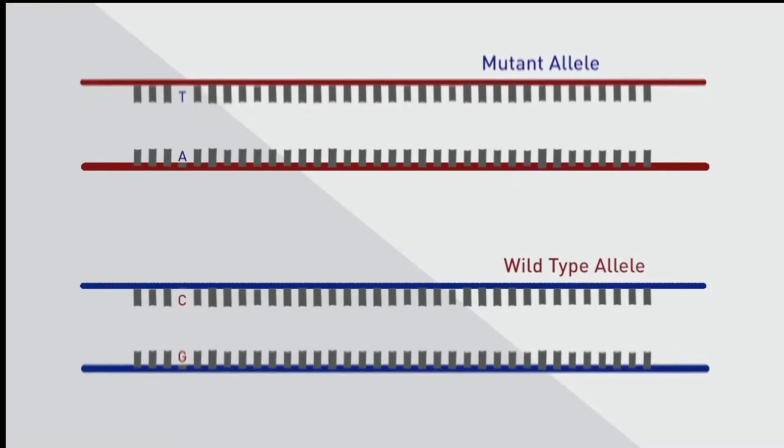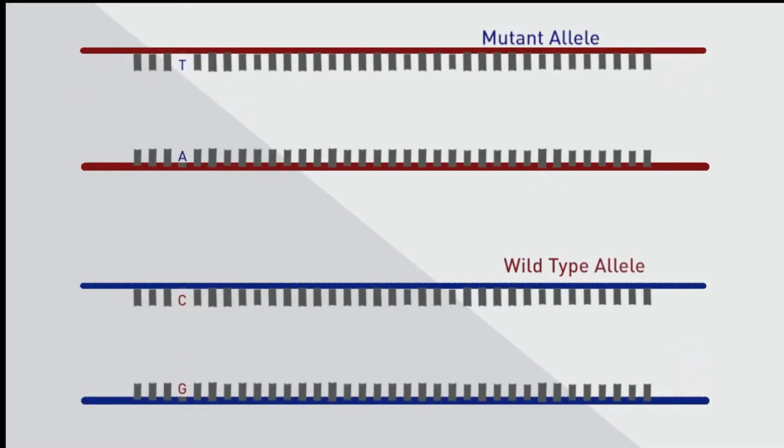A mutant allele assay based on qPCR technology contains 4 components. The allele-specific or AS primer is designed to be specific for a mutant allele in a target gene. A locus-specific primer is designed to be specific to the target gene. This will bind to mutant and wild-type allele containing DNA.